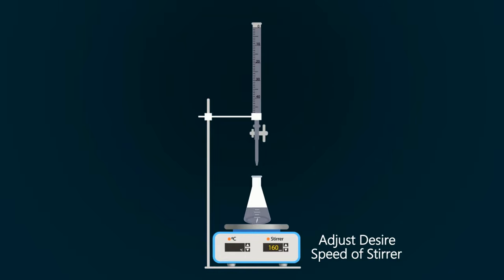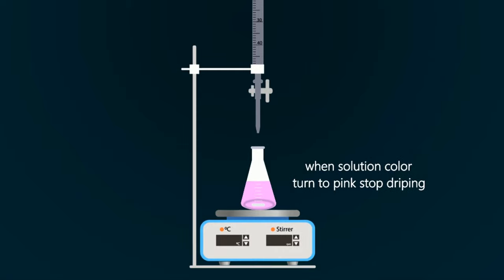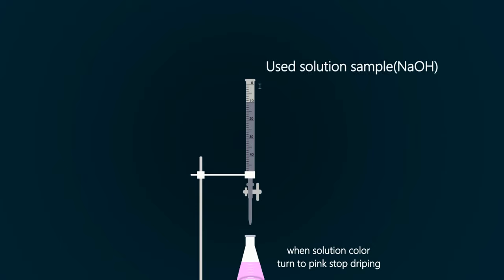Now start adding NaOH solution dropwise. You have to stop the burette when the color starts turning into pink. Stop the burette and note down the reading of NaOH used, which is 10 milliliters.